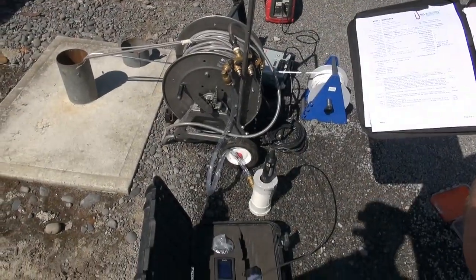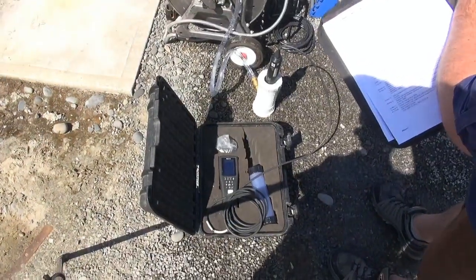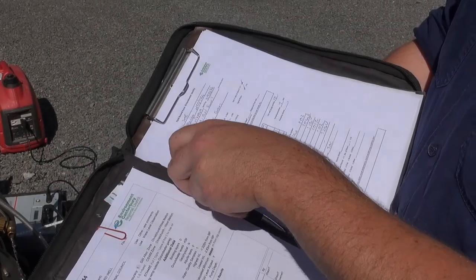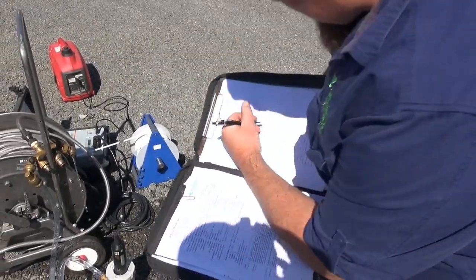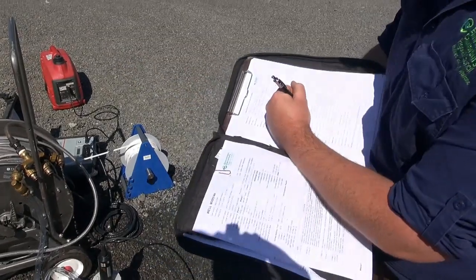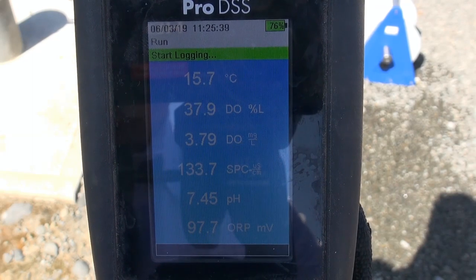A further 7 minutes has passed. Temperature is now 15.6 degrees, pH is still 7.44, and dissolved oxygen is 3.84 — so the readings are changing, so we continue to wait. Final reading: temperature 15.6, pH 7.45, dissolved oxygen 3.78. So they are within our limits of 5%.